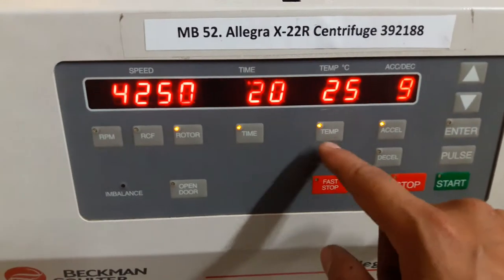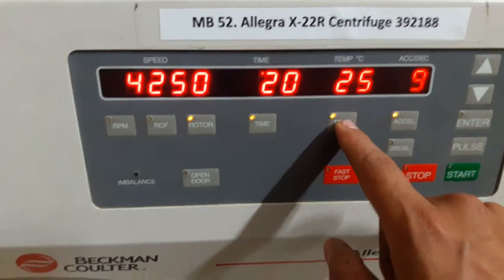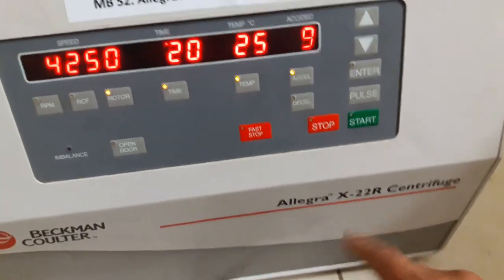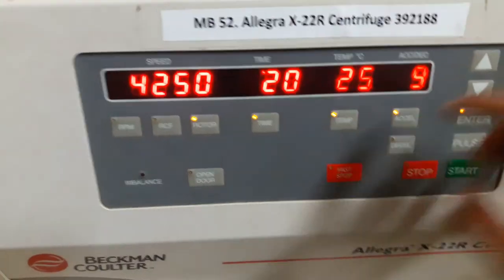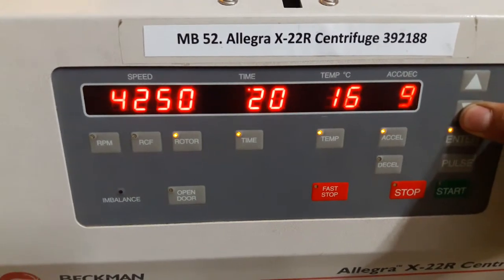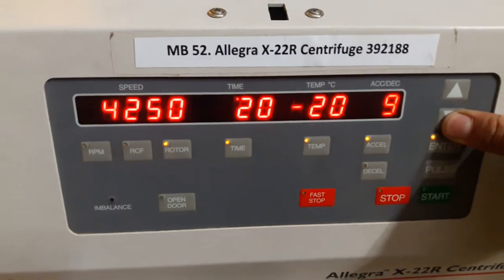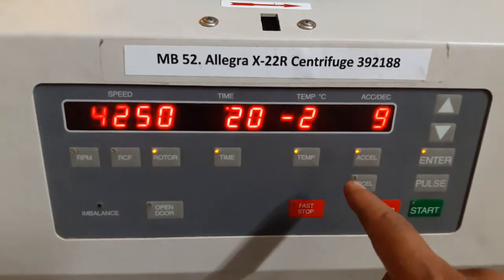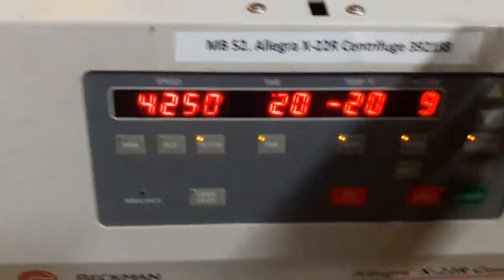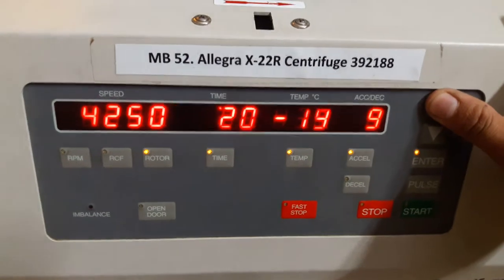This button is for setting temperature. This is a refrigerated centrifuge, so I can vary the temperature according to my need. The lowest possible temperature for this centrifuge is minus 20°C. I'm not selecting that right now.